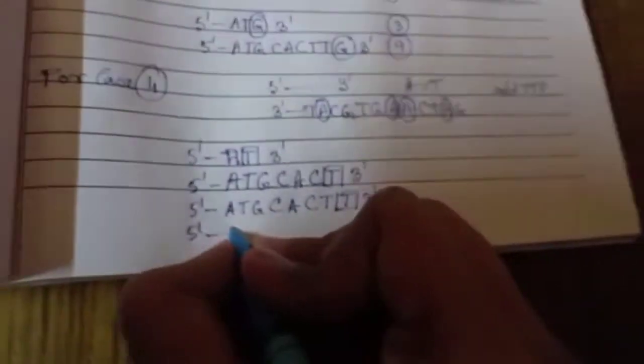For case 4, we add the dideoxyribonucleotide ddTTP, and we know that thymine pairs with adenine. So here the adenine will terminate by adding this ddTTP, and we will get 4 fragments where the adenines are present.